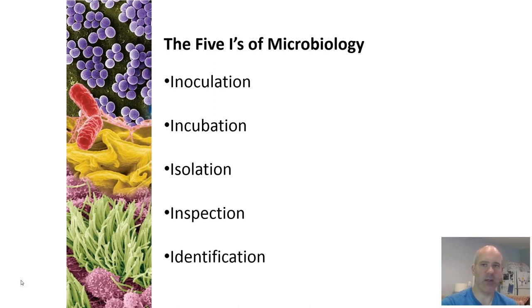Now things are changing, so now we have these DNA-based techniques, genetic-based techniques that are very similar to what people in forensic science use, for example, and those types of techniques are beginning to change some of the traditional requirements for culturing or growing microbes in the laboratory. We're probably not too far from the point where you'll just be able to do DNA testing on a microbe and identify what it is without even having to grow things in the laboratory, but we're not quite there yet.